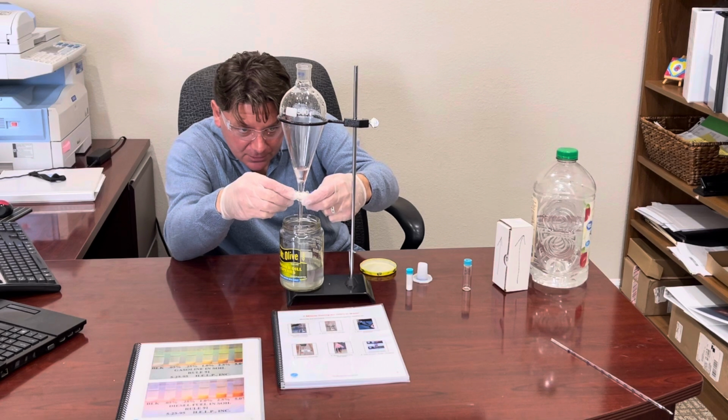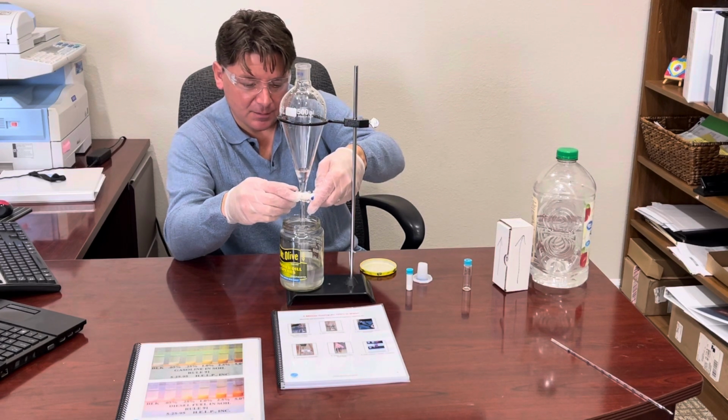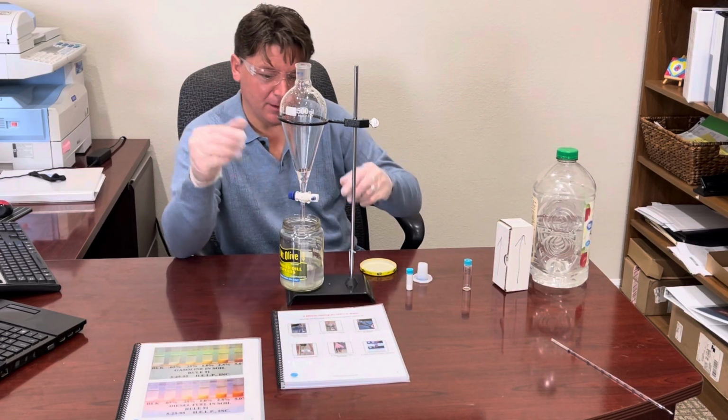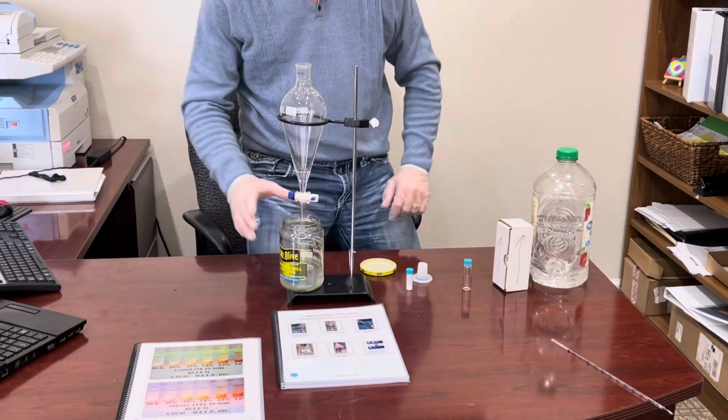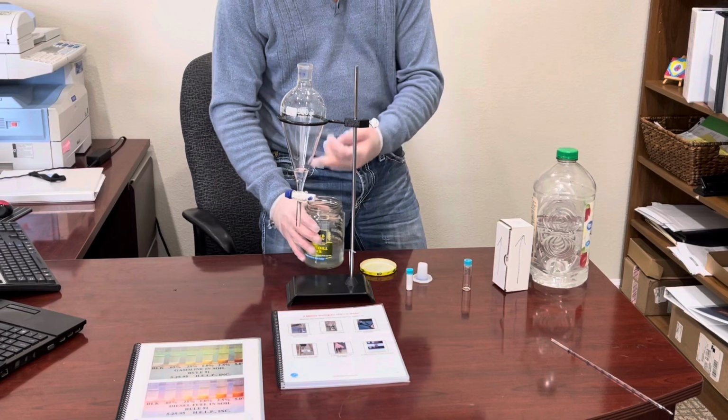Now right here, we can still see there's a little bit, this is the water right there. We want to make sure we get all that water out to the point we let a little bit of solvent go through, because that solvent is what we're interested in, and we want to make sure we don't have any water.